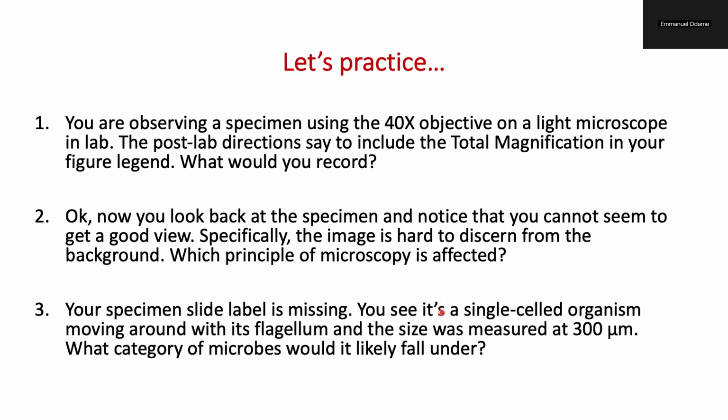So now let's practice. Question 1. You are observing a specimen using a 40x objective on a light microscope in the lab, and post-lab directions say to include the total magnification in your figure legend. What will you record?